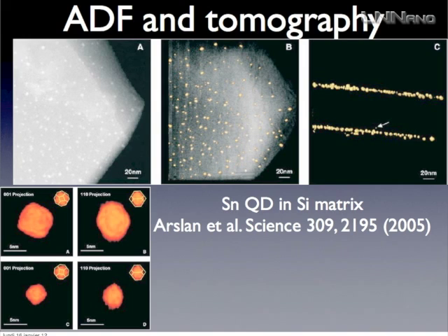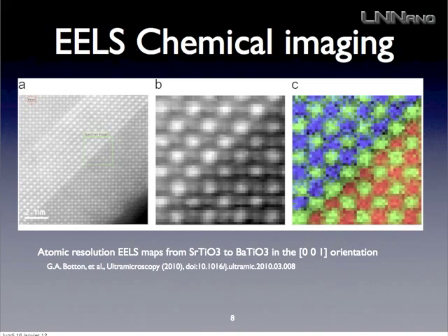You will be in zone axis, and then you will have a lot of diffraction effects in high resolution TEM, which will, in a sense, kill all the important information for tomography. This is, if you do it well, not the case in HAADF. So HAADF is most probably the best technique for tomography. And if you want to know more about that, I'm not a good person to talk, but there will be some Spanish guy coming today, Raúl Arenal, and he knows quite well this kind of geometry. Okay.